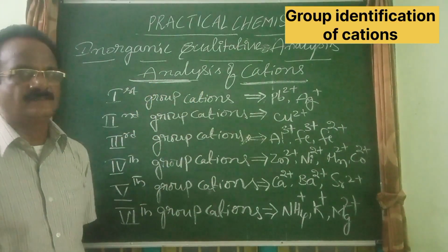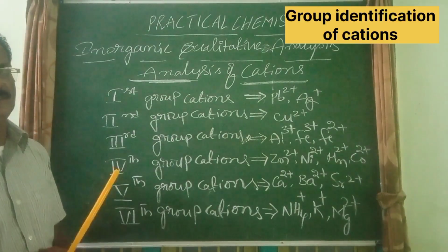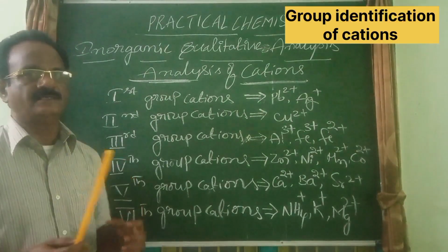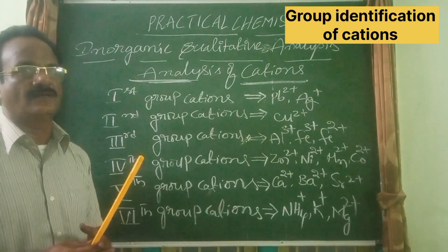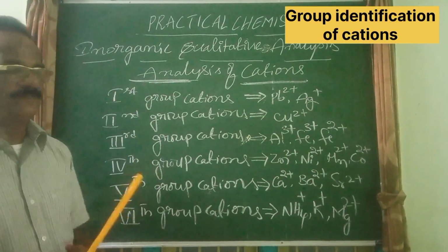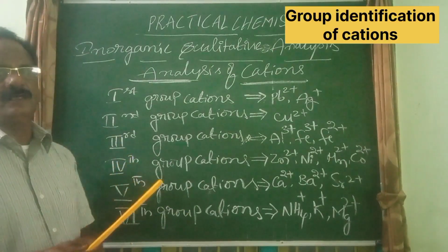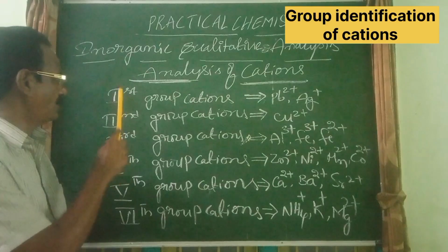Properties of cations in mixture analysis. Before going to analysis, let us see what is a grouping of cations in inorganic practical chemistry. According to the systematic procedure, the cations are divided into the following groups.